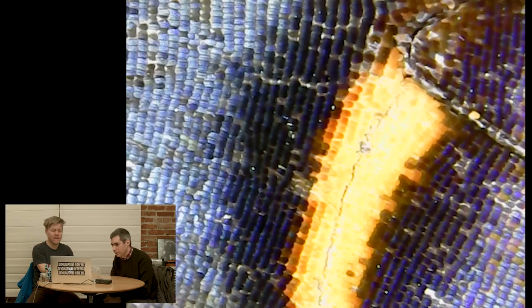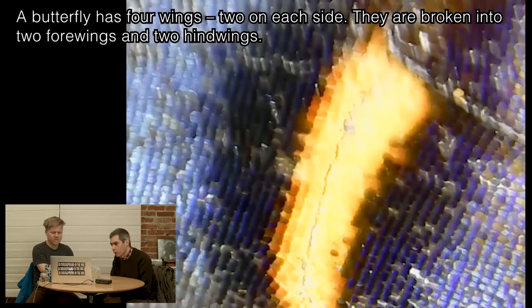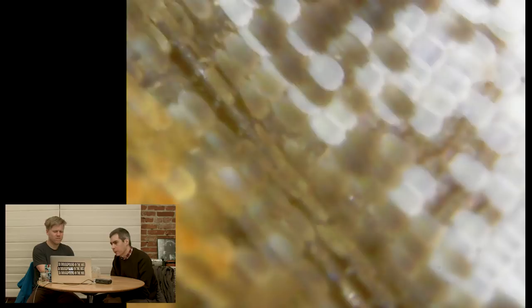The wings almost look like halftone. Yeah, look at that. It's like a weave or something, like a quilt. Want to go 1000x? You see every little pixel. Oh, look at that — it's like scales. Yeah, almost like feathers, really. That's the butterfly zoomed a thousand times in on the edge of the wing. That's incredible. They look like feathers.